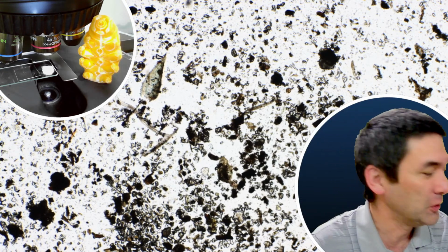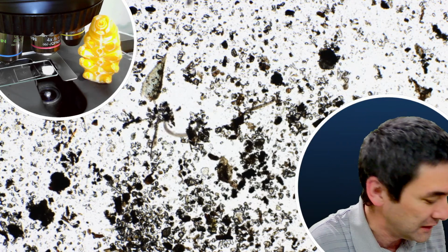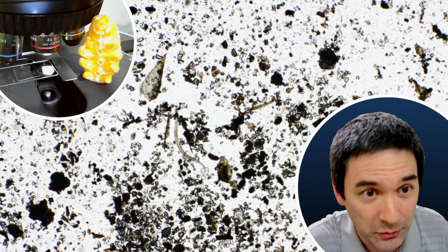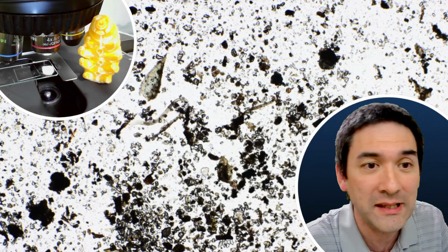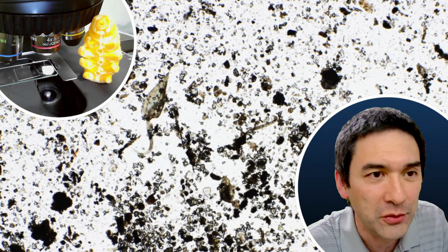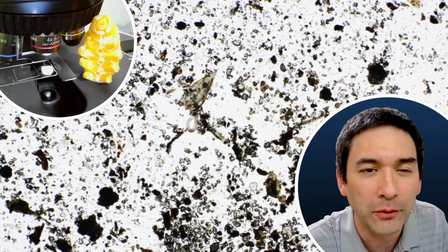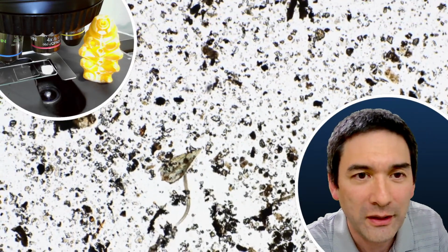Okay, but still, I did prepare in case I'm not able to find any tardigrades. I mean, I found several of them today in the afternoon. I tried to prepare it, but right now they just walked off my slide. What we see here is a nematode worm, but I did prepare some videos if indeed I'm not able to find one. But I've got a whole bunch of moss here, so I'm quite confident.